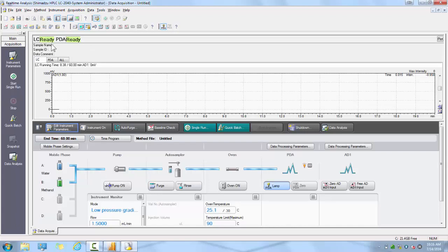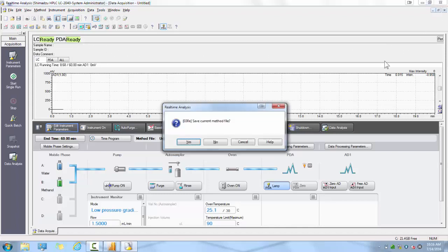Now that you have configured your system communication settings and hardware configuration, you'll be able to launch directly to that instrument from the Instrument tab. If you ever have any issue with your instrument and PC communication, be sure to check your hardware configuration screen to see what your system is detecting as viewable.